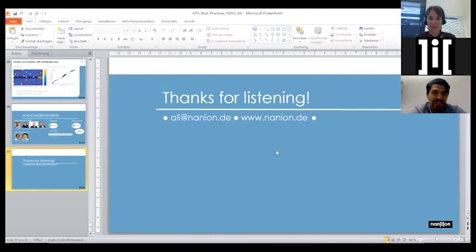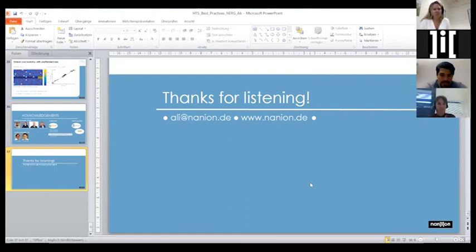Thank you for the presentation, Ali and Sonja, that was wonderful. The initial question, Sonja: are these best practices written down only for manual patch clamp or also automated patch clamp? Or maybe you can comment on this a little bit more. In the document, it specifically says manual and automated patch clamp. So it looks like the recommendations are generalizable. So it's for both methods.